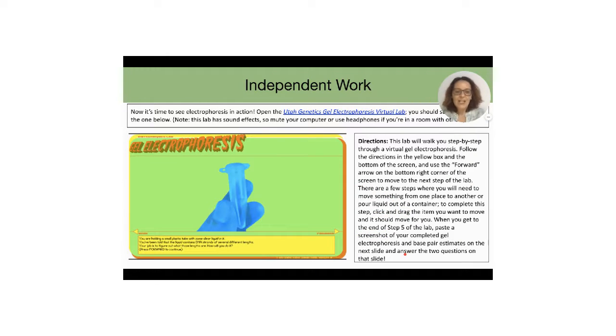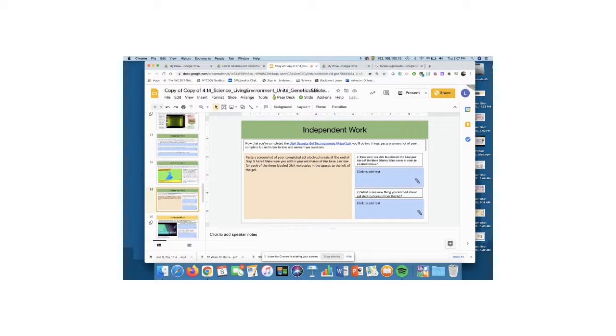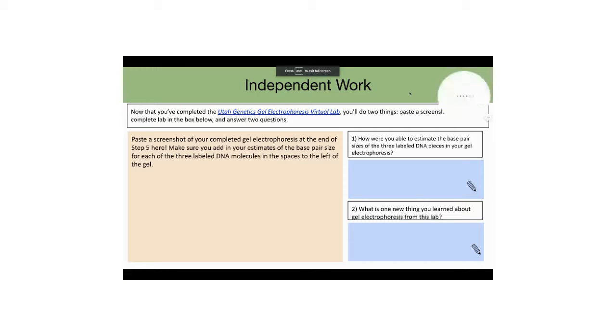slide. All right, so when we go to the next slide of your assignment, we are going to be able to see that you must paste what they're asking you to paste right in here. And that's a screenshot of your complete gel electrophoresis right here, adding your estimates of the base pair size for each of the 3 labeled DNA molecules in the spaces to the left of the gel. All right, after that, we will be answering together these 2 questions. Let's go to the lab and let's start.